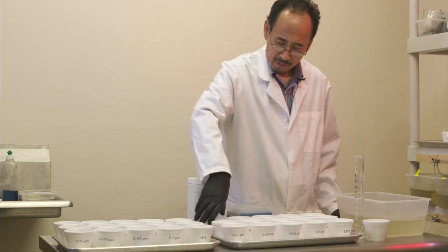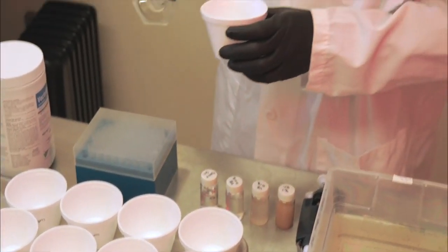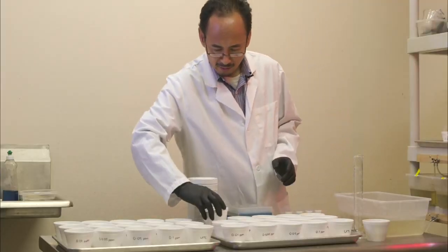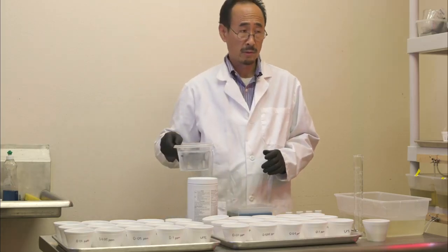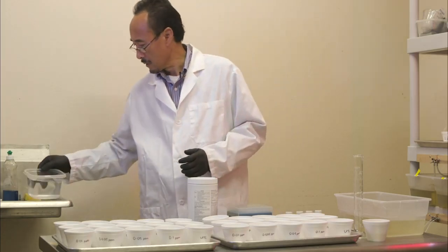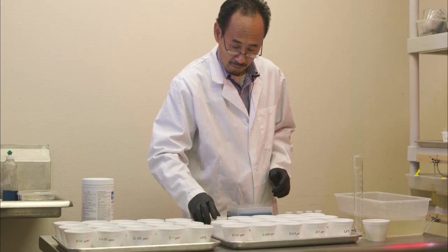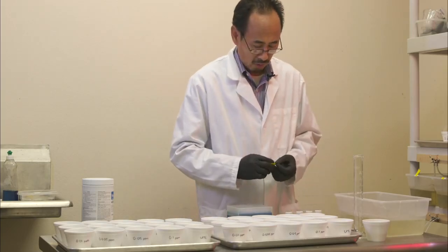So for each and every cup, what I do here is, I will add 100 ml of water to it. This water is tap water, but make it best. You can prepare your water, like put it in the container and sit there for 24 hours in the room temperature to remove the chlorine. So it's safer for the mosquito larvae. Then you're gonna add mosquito larvae.